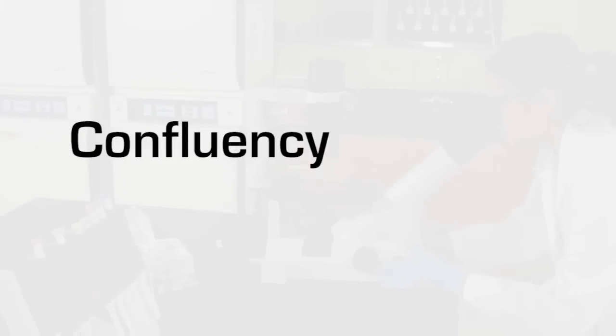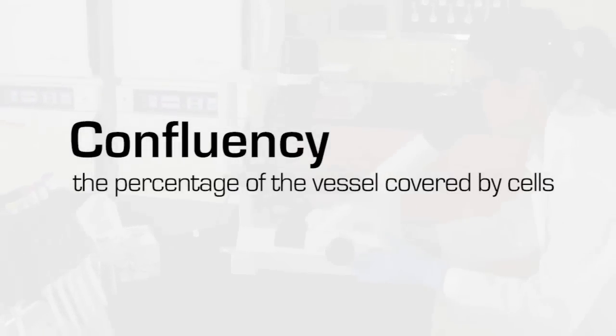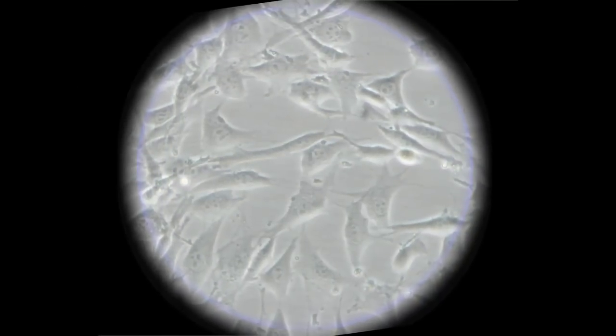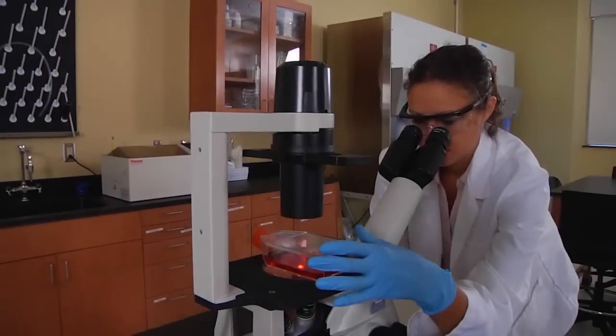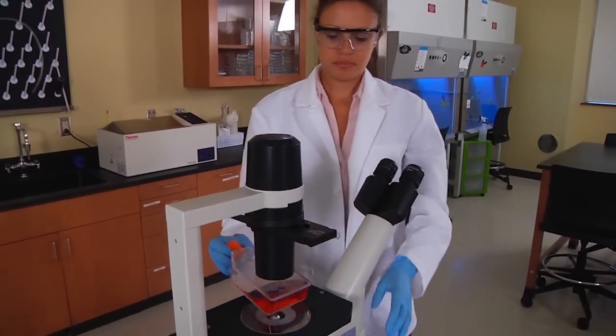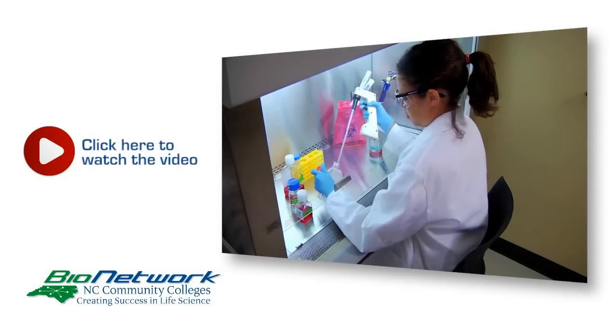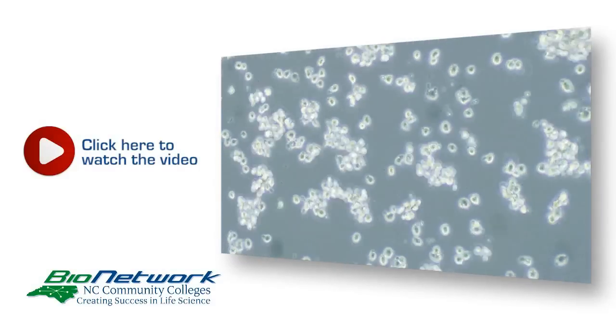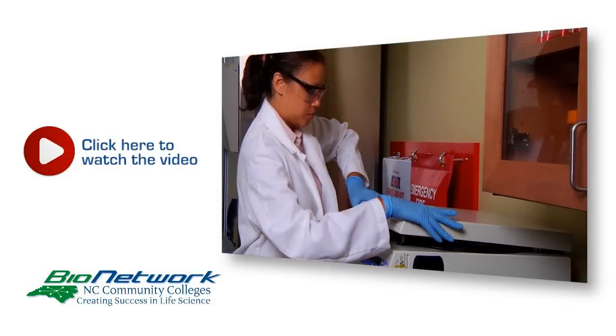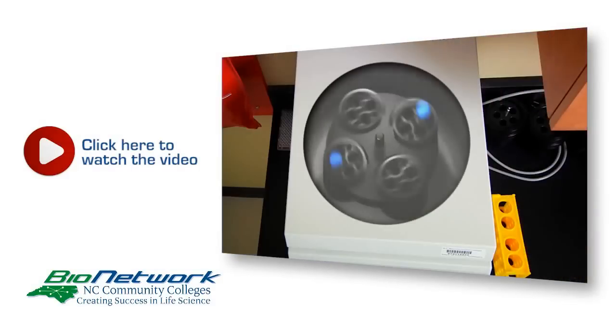Next, calculate the percent confluency. Confluency is the percentage of the vessel covered by cells. Our cells are at about 90% confluency. To begin, trypsinize the cells to generate a single cell suspension and count the cell suspension. Click the link on your screen to watch a demonstration of these steps.